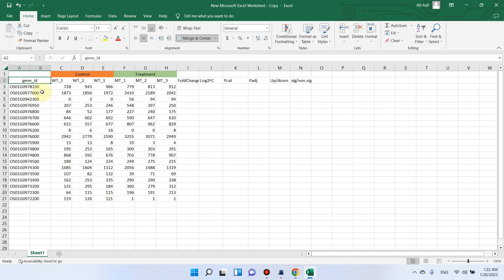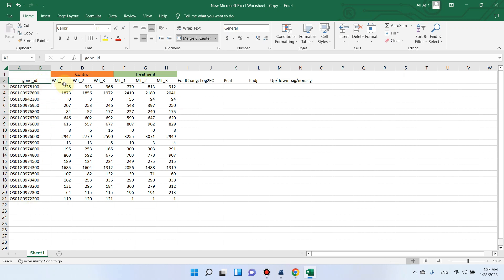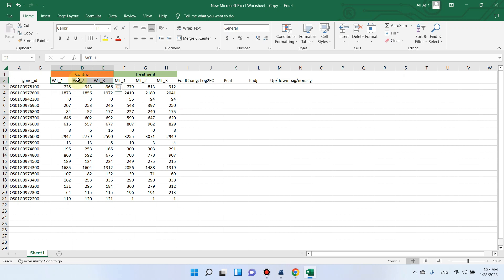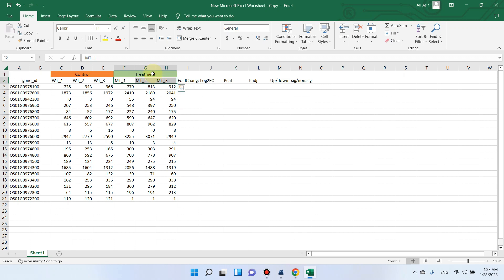As we know, whenever we send our samples to the company, the company usually sends us all the RNA-seq data in the form of gene IDs and in the form of base reads. Here you can see I have three replicates of wild type — and we know that usually wild types are the control — and here is my mutant type, with three replicates of mutant type, which are considered as treatment.